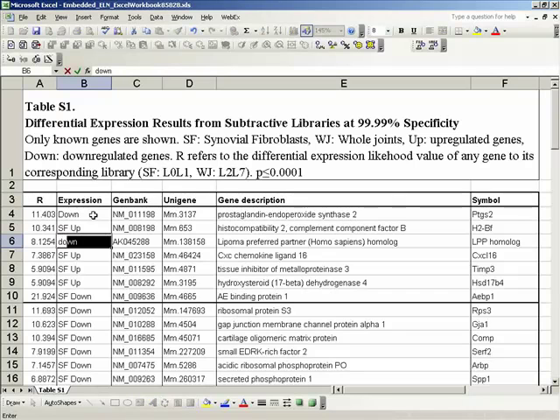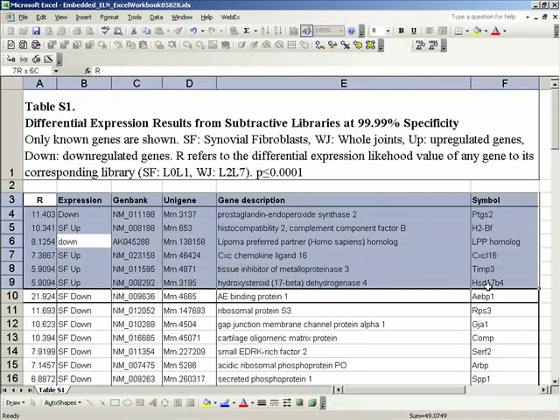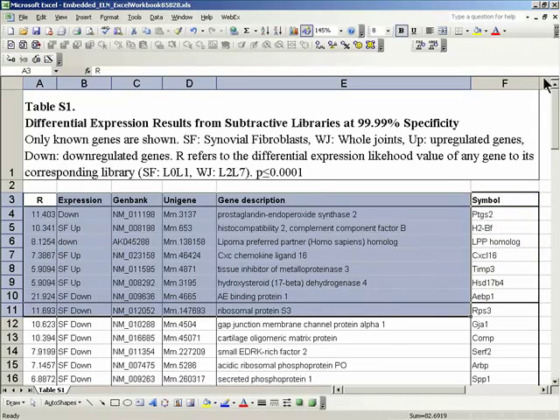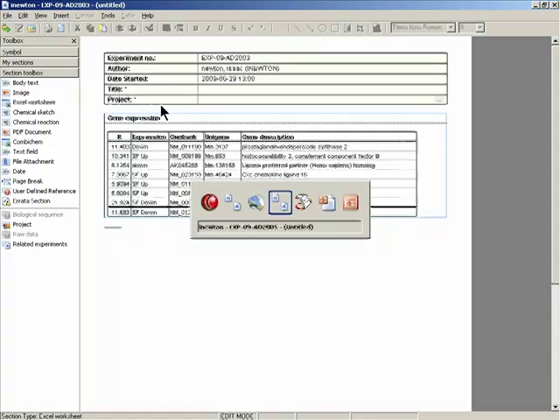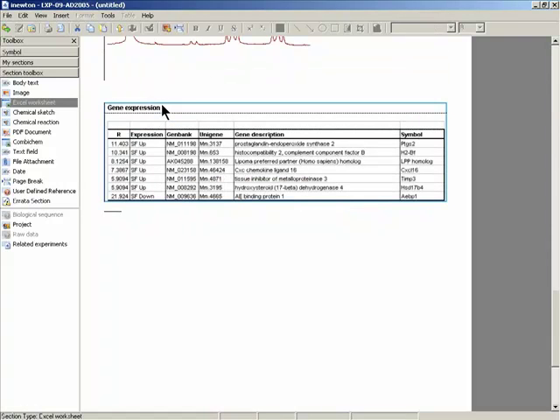Maybe we're doing another experiment, something similar. Again, then select the cells, close Excel, and the new Excel file is saved in the database, and the new data is shown on screen and in the experiment. So we go back to our first experiment now.